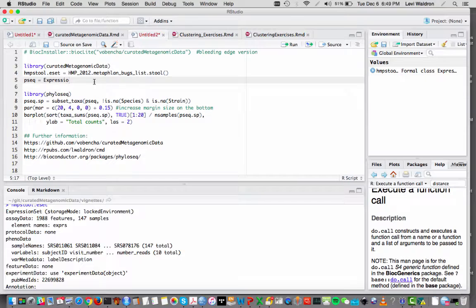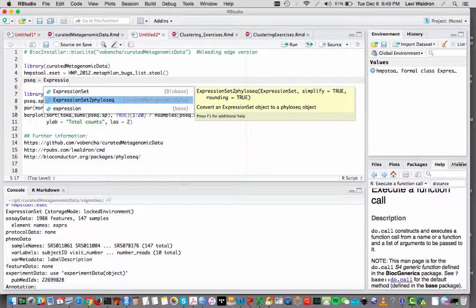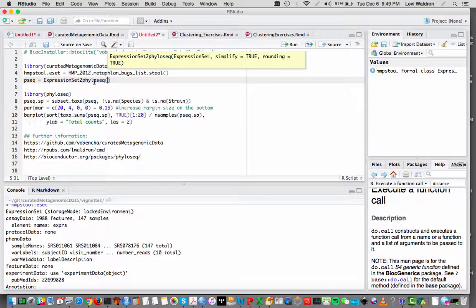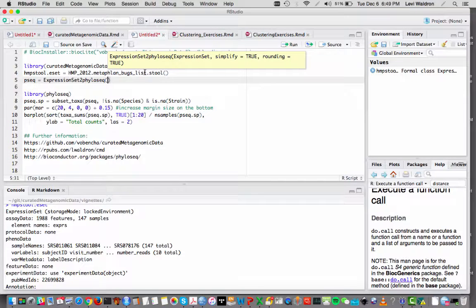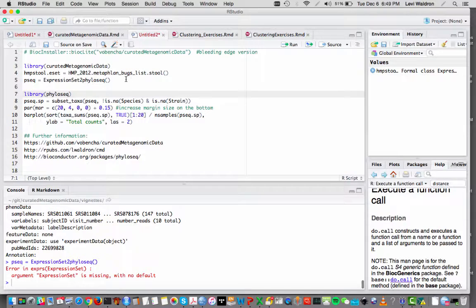The curated metagenomic package provides this function called expressionset2phyloseq that for the MetaPhlAn bugs list, it will convert those into a phyloseq object for use with the excellent phyloseq package.